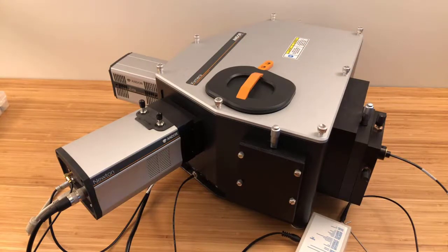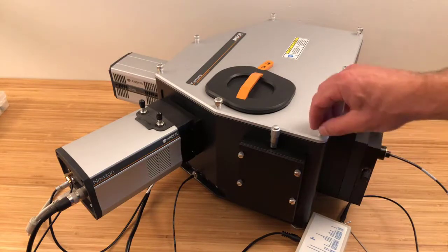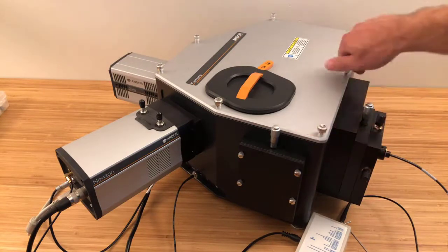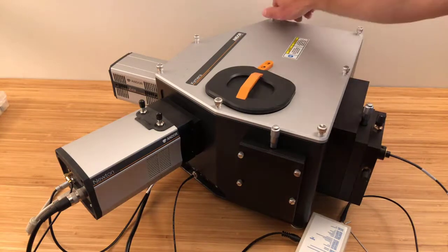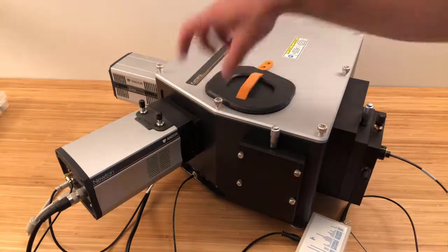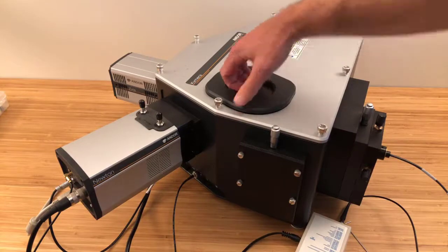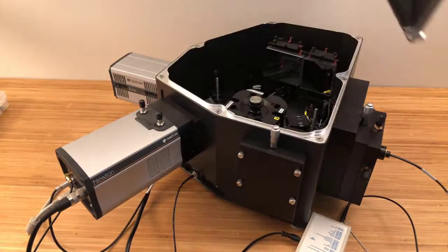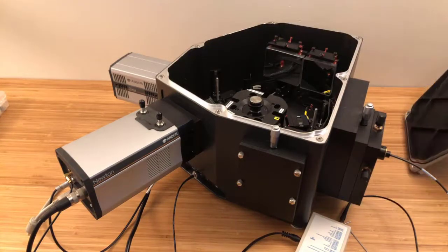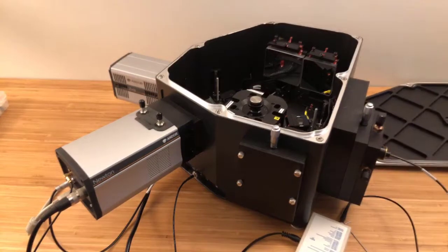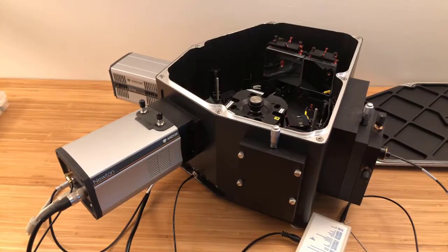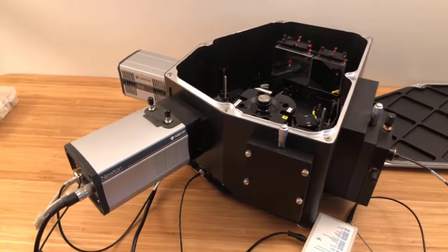And I'll take the top off now to show you the optical path inside and some of the features on the inside. So these are some captive fasteners here. We can just unscrew these, make sure they're unscrewed, and that'll provide us access to the inside. And I'm going to reposition this camera to give you a better view of what's going on the inside here.